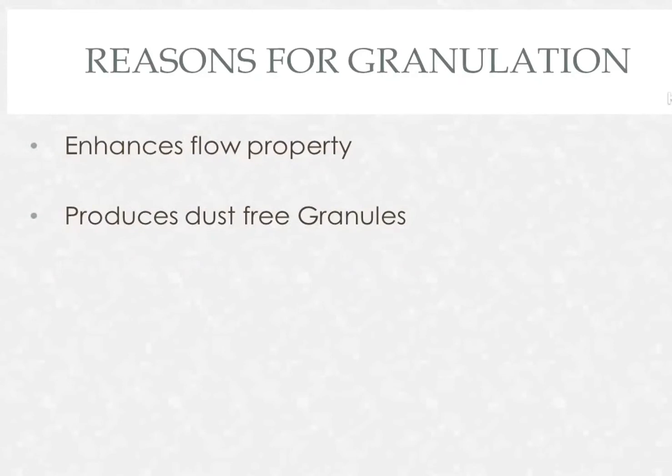Now this is one of the most important reasons of why we need granulation. In a simple direct compression, we just mix active ingredient and excipient in a polythene bag, and then we mechanically shake it with our hands. So that creates a lot of dust in the room. So to avoid that dust, we use granulation.